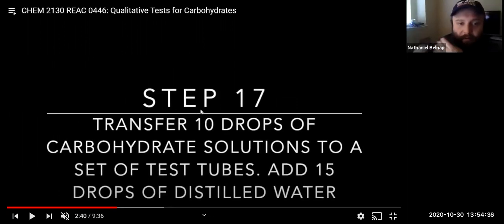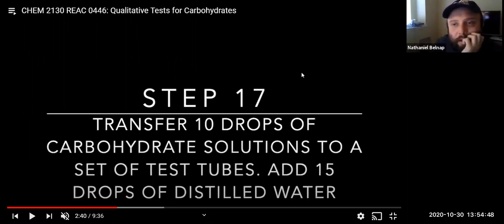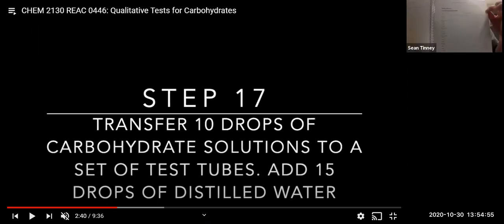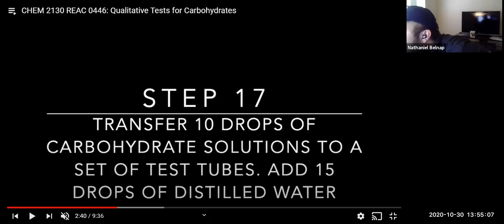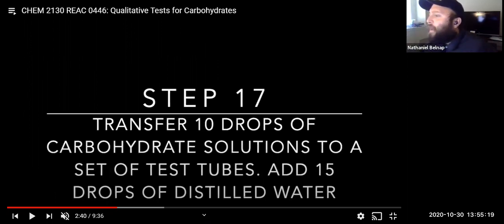They're going to transfer the. Also, what about the line above the final, the Barfoed's time? Like, what do we put in those lines? I can't see the paper right now. But what does it look like? Hold on, let me. I think that's where you put the positive or negative, I think. Yeah, I would just not even worry about that one. You only need to put a positive or a negative, so that might just be an extra line or something.